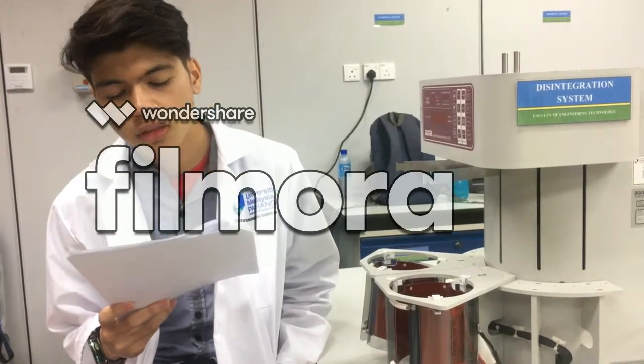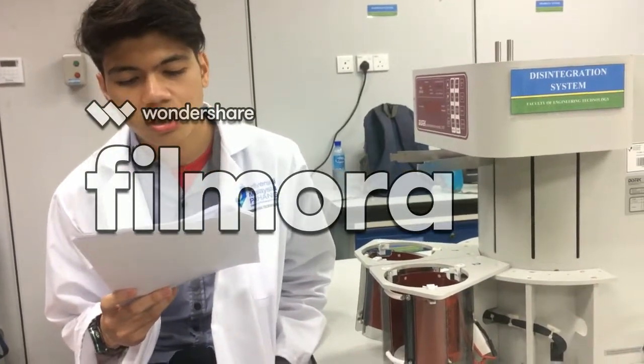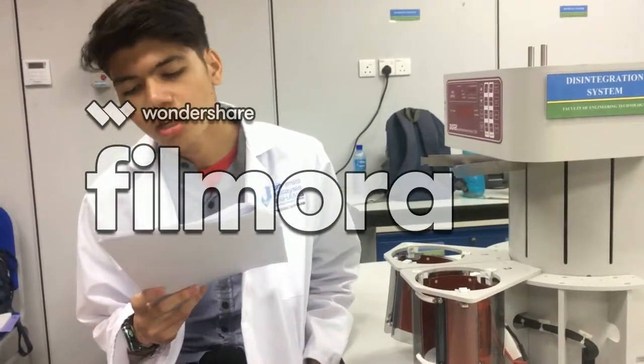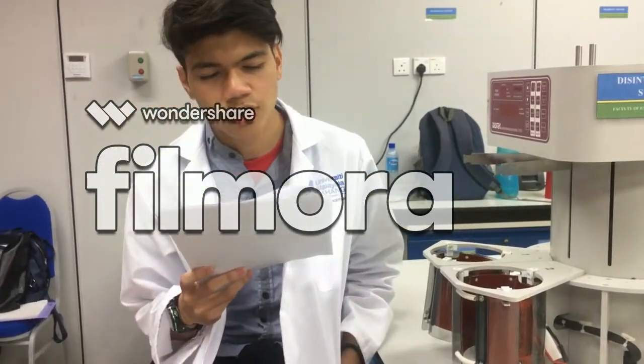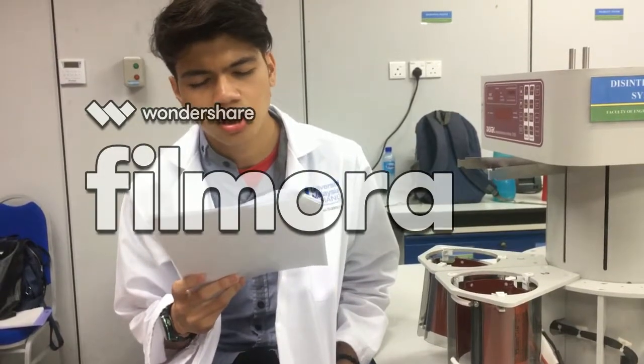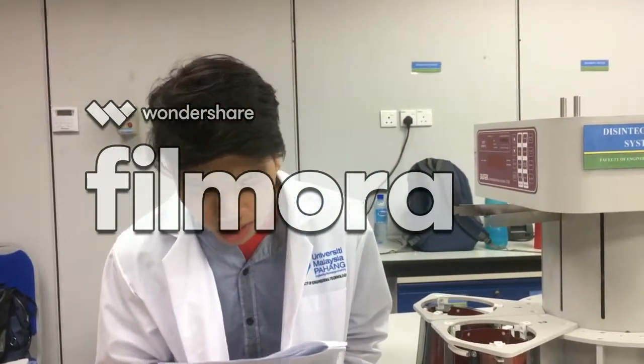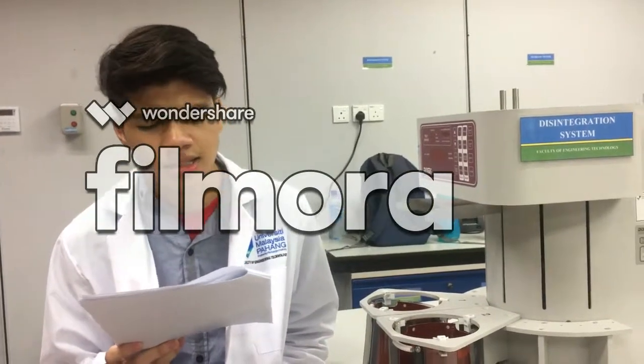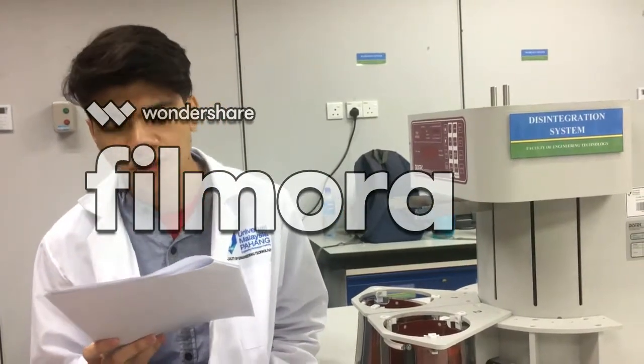So the time of disintegration will measure the quality of the tablet, and if the disintegration time is too long, it means that the tablet has not reached the quality that it needed actually, and it will indicate that it has maybe inconsistency and maybe lack of batch uniformity.